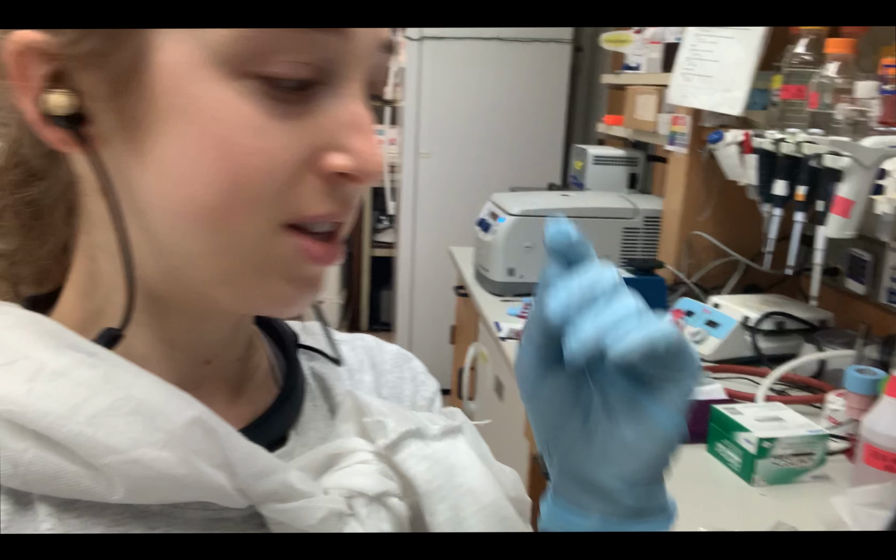I want to tell you about an experiment that I do a lot, but I haven't really told you much about before, and it's a radiometric kinase assay with scintillation counting. That sounds like a lot of mumbo jumbo, but basically it's a method that we can use to measure the activity of kinases, which we talked about before.